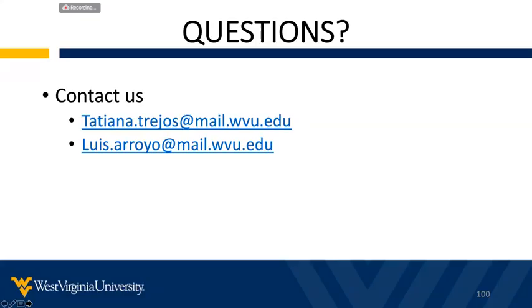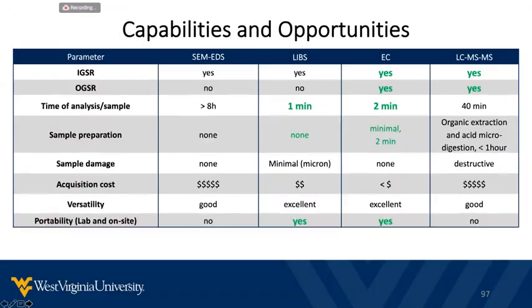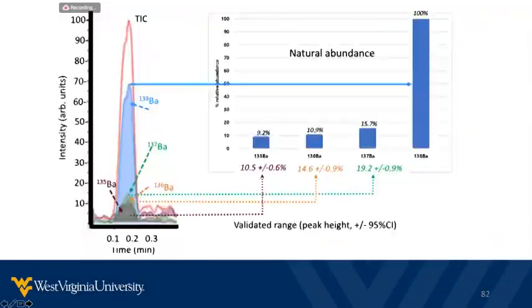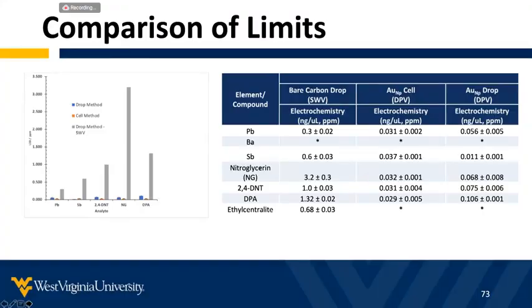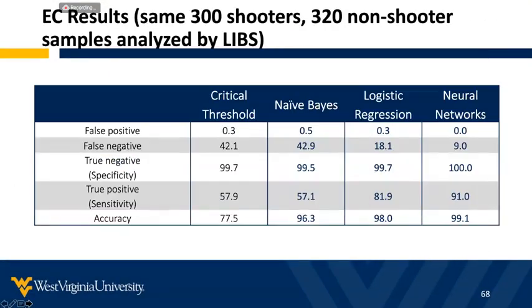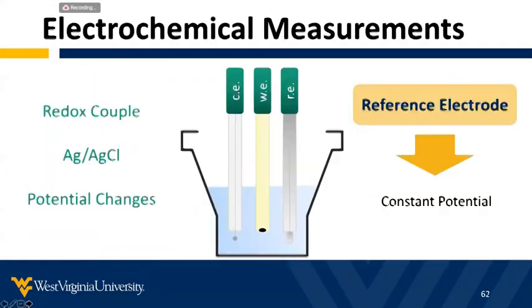Okay. Next question asks, what type of weapon was used to place the gunpowder into the air? So we use, let me see if I can go back to that. I think I have ammunition here, but we have used many different types of pistols and revolvers, and different types of ammunition, different calibers. We haven't tried rifles yet. It has all been handguns like pistols and revolvers. Let me see if I can find that slide quickly to show you more details.